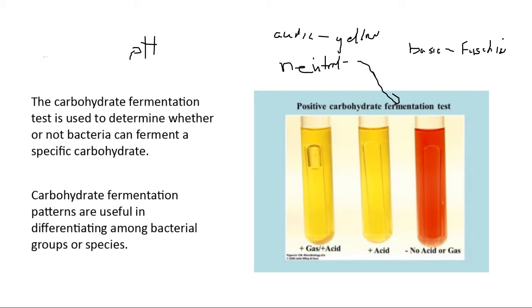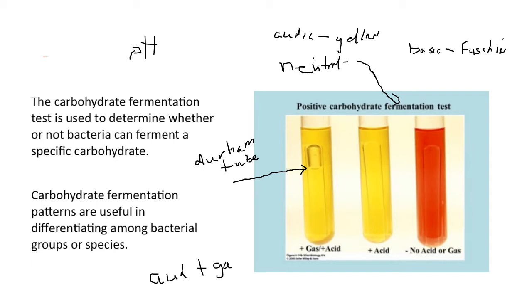You'll notice there's a little inverted tube in the test called the Durham tube — D-U-R-H-A-M. The Durham tube's sole purpose is to capture metabolic gas. In order to have a true fermentation, you have to have acidic conditions and the formation of gas. Gas will only be produced in acidic conditions. If gas is produced, it will be captured in the Durham tube, causing a displacement of liquid and leaving a headspace, which indicates metabolic gas was formed.